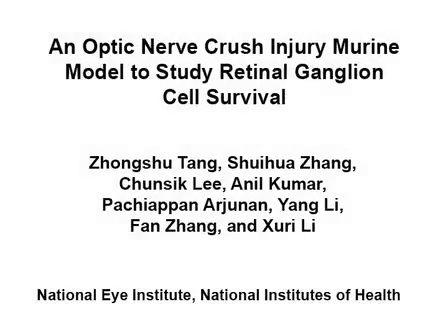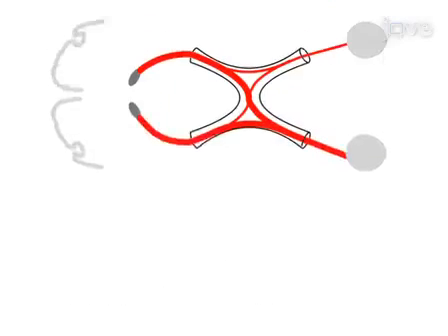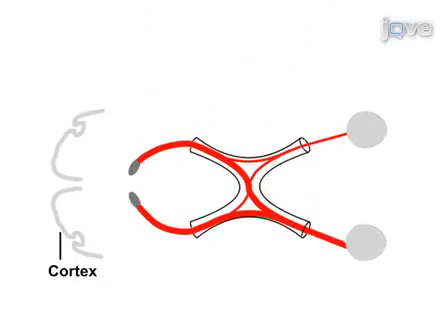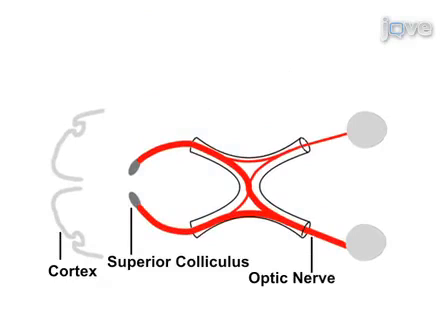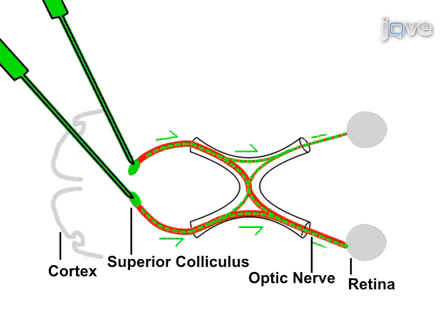This procedure demonstrates the optic nerve crush injury and subsequent analysis of retinal ganglion cell survival in a mouse model. This is achieved by injection of a fluorescent dye into the superior colliculus on day one. The dye is retrogradely transported to the retinal ganglion cells to label this cell population.